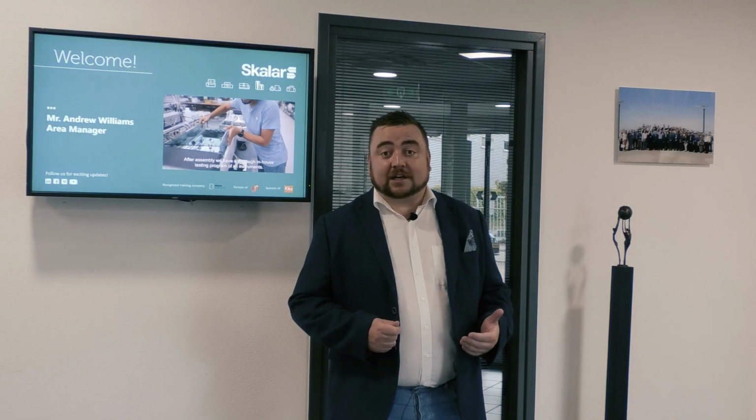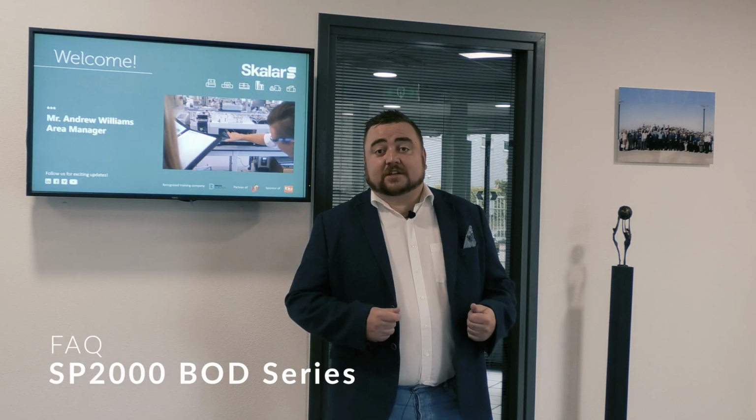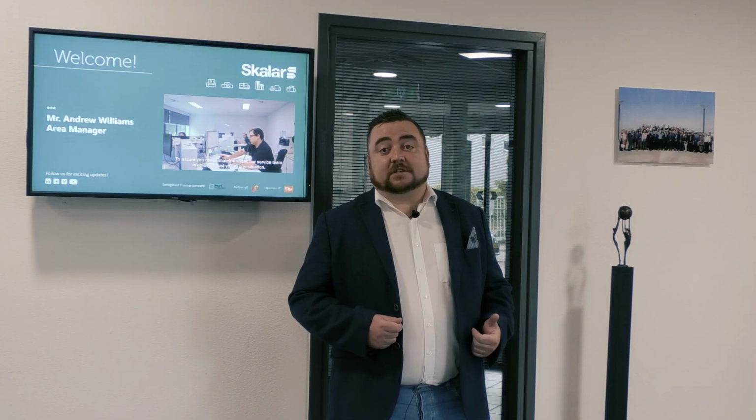Today is part 2 of an ongoing series of videos where I'm gathering up the 5 most frequently asked questions across all our different product groups. And today I will be talking about the BOD application, Biochemical Oxygen Demand, this application on our SP2000 series of robotic analyzers.